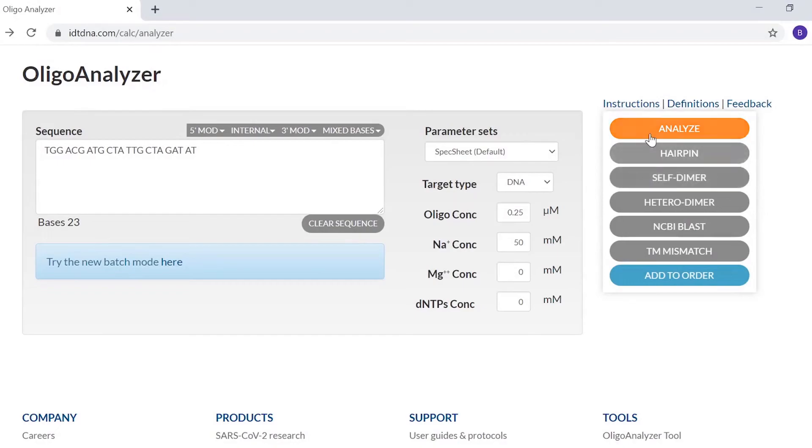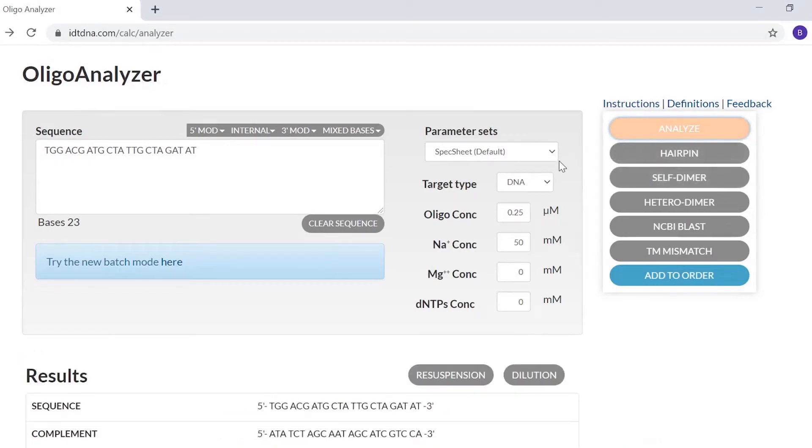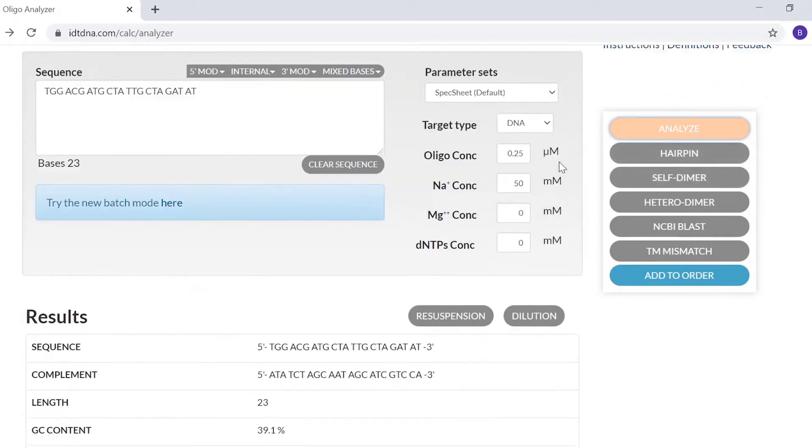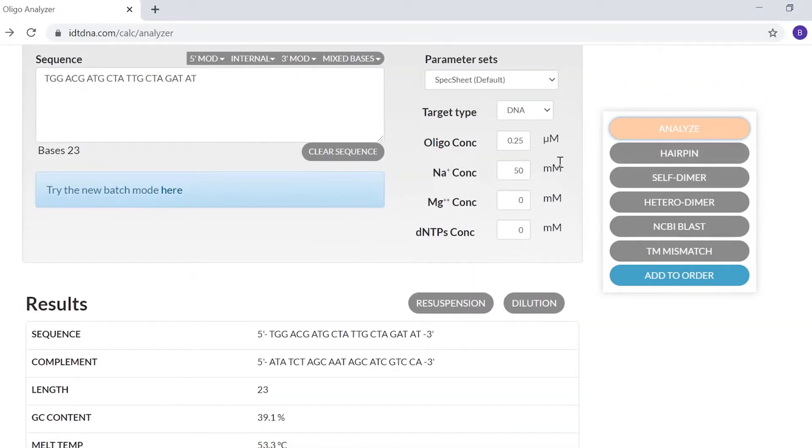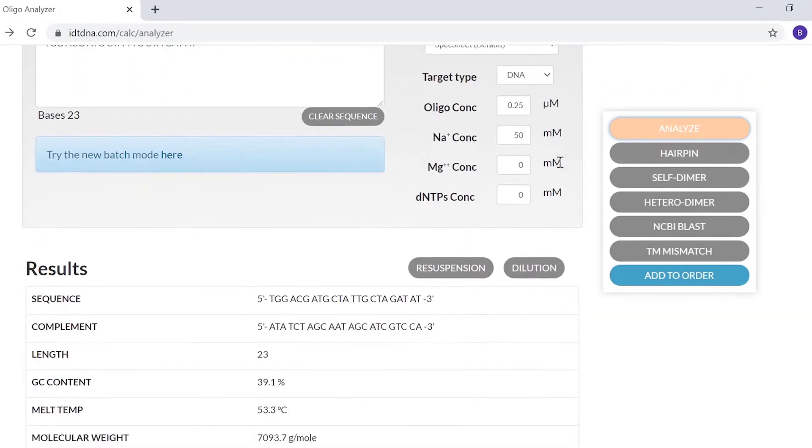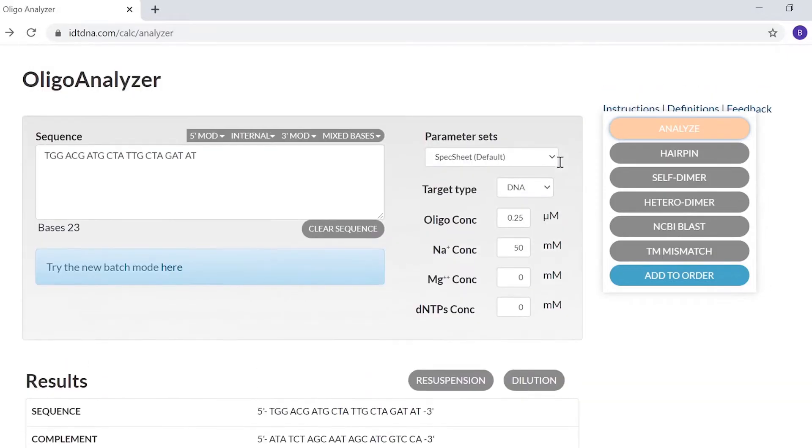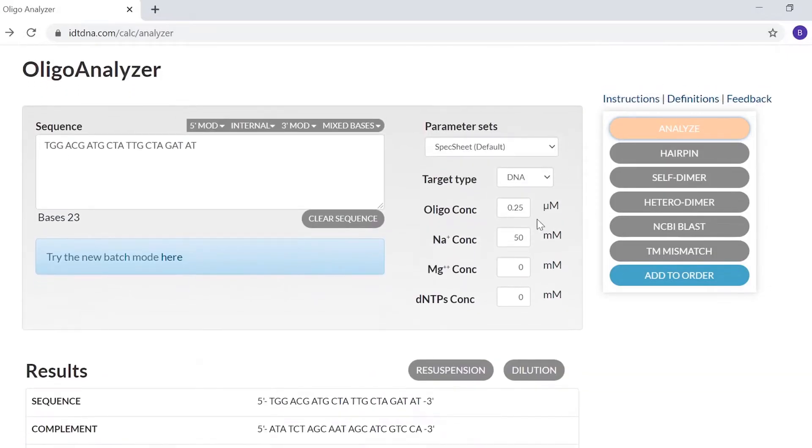While in the Analyze function, you're also able to link directly to IDT's resuspension and dilution calculators. These easy-to-use tools quickly and accurately calculate the volumes for resuspension and dilution of Oligos.